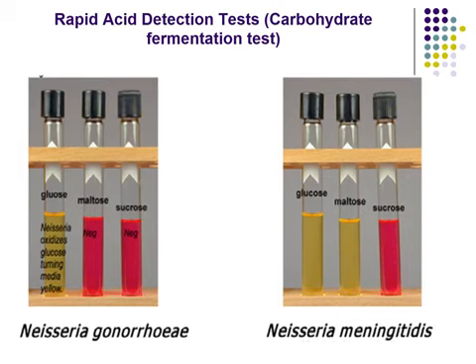Neisseria gonorrhoeae ferments only glucose, while Neisseria meningitidis ferments glucose and maltose.